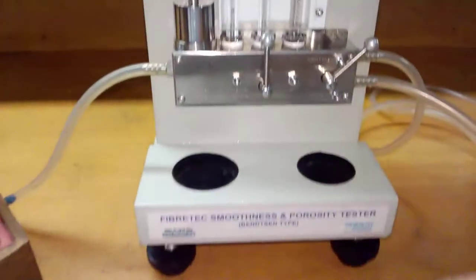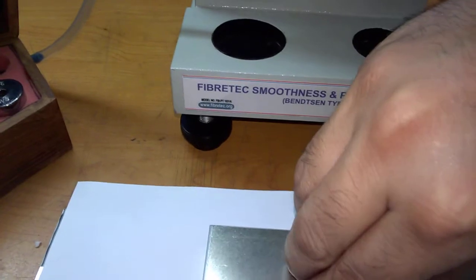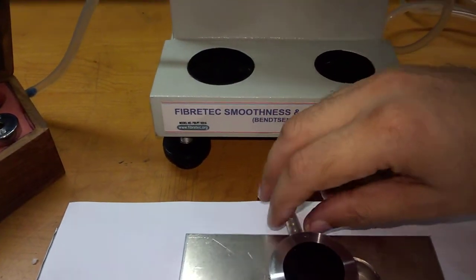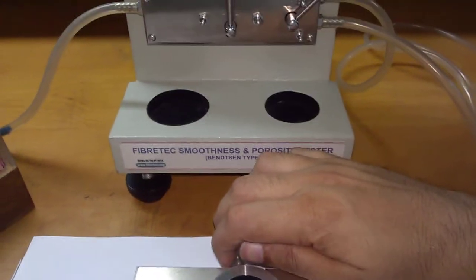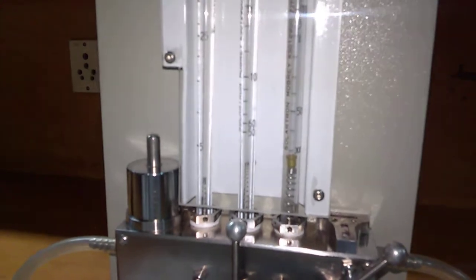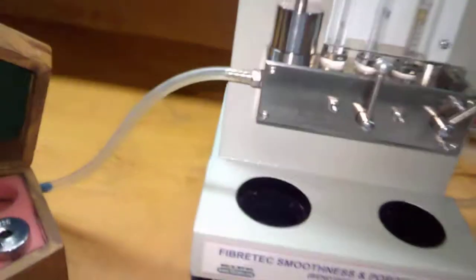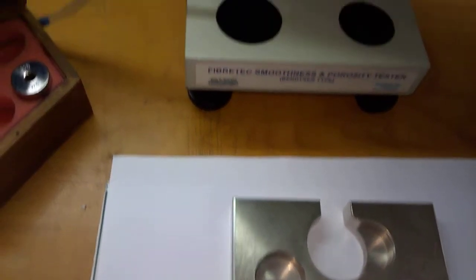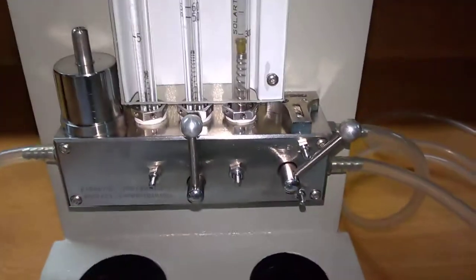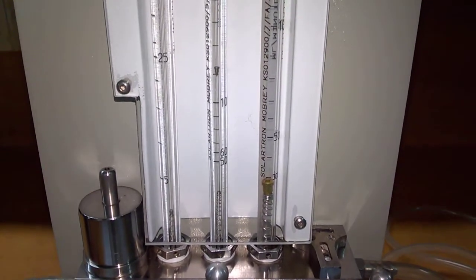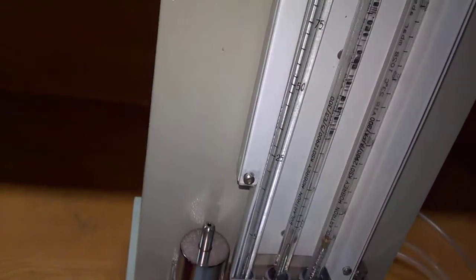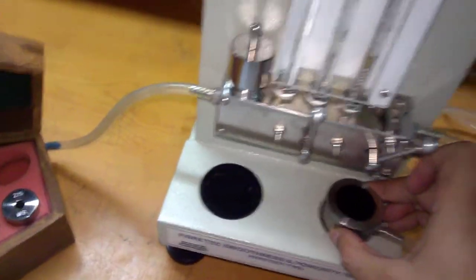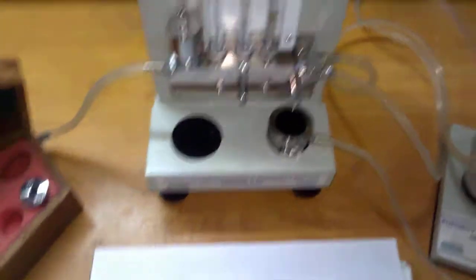We can use it for different positions. Here in this position, it is 160 ml per minute. We can change the position like this. It is 120 ml per minute. This is how you check the smoothness. We can place the head over here. It has to be taken very carefully.